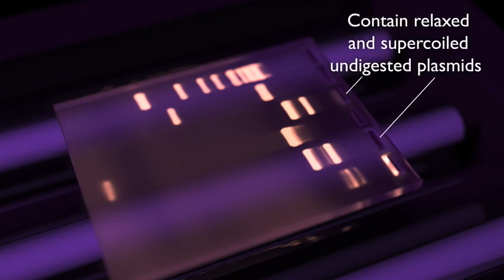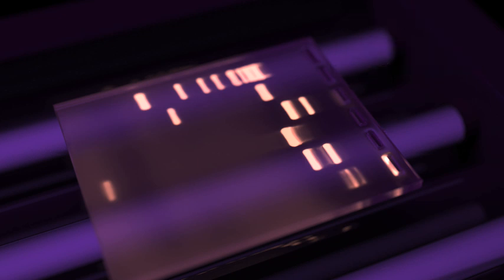The control lanes carry the original, uncut, and cut plasmids, which migrate at a different rate when compared to the recombinant plasmid. The control samples confirm that the sixth lane actually contains recombinant plasmid.